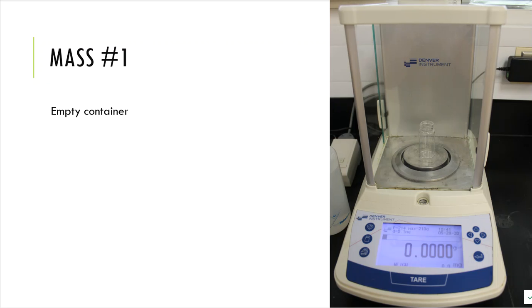It doesn't have to have a lid. The things that I'm using, they don't evaporate off very easily, so they're going to stay behind. I don't necessarily need a lid for that. If it was something that did evaporate off easily, then I would have to use a lid, so that way all of the sample will be trapped and contained in the container, which is why we call it a container, people. All right, so here's the balance. Here is my empty container on top of that balance, and I have tared that balance.